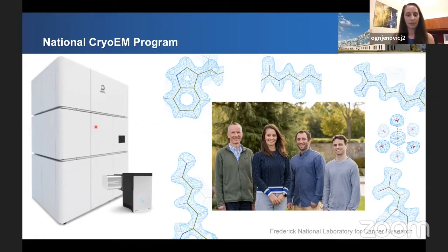The Cryo 200 microscope is equipped with an in-column omega energy filter to remove inelastically scattered electrons that would otherwise just add noise to the image. And our microscope has Gatan's K3 camera installed, which was chosen because of its high frame rate that offered the potential for maximal throughput when using counting mode.